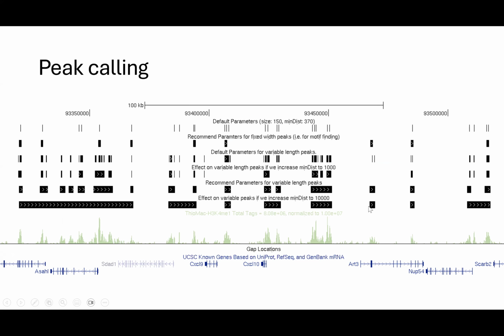Unfortunately, there's not really a right way to do this at the moment. It matters a bit what your target is, and I would try to stay as close as possible to what other people have done in the literature for your target. But there isn't really a ground truth of what the size of the peak is supposed to be, particularly if you're doing a new sample and a new target.